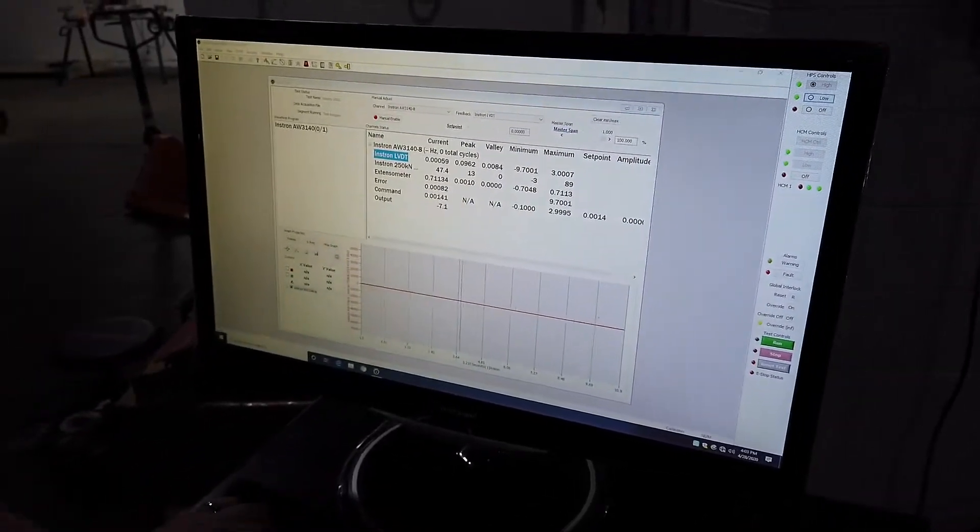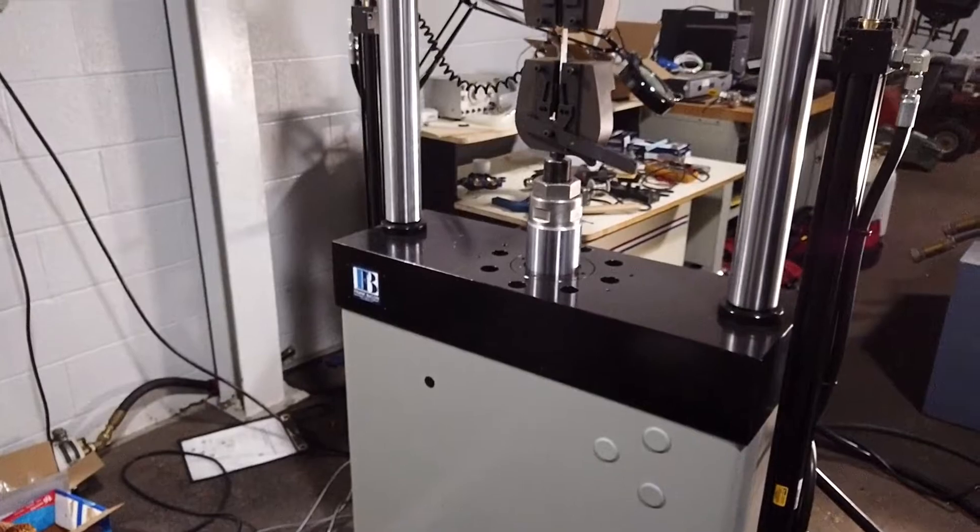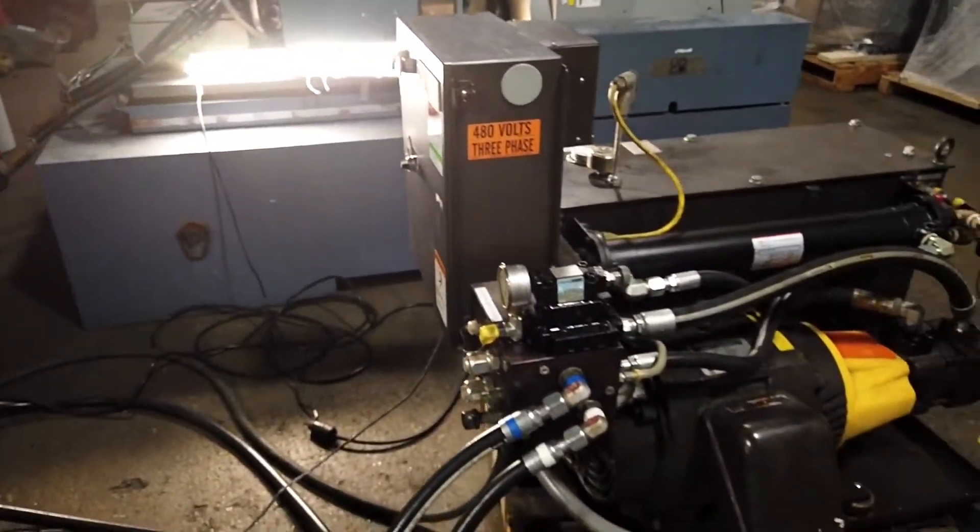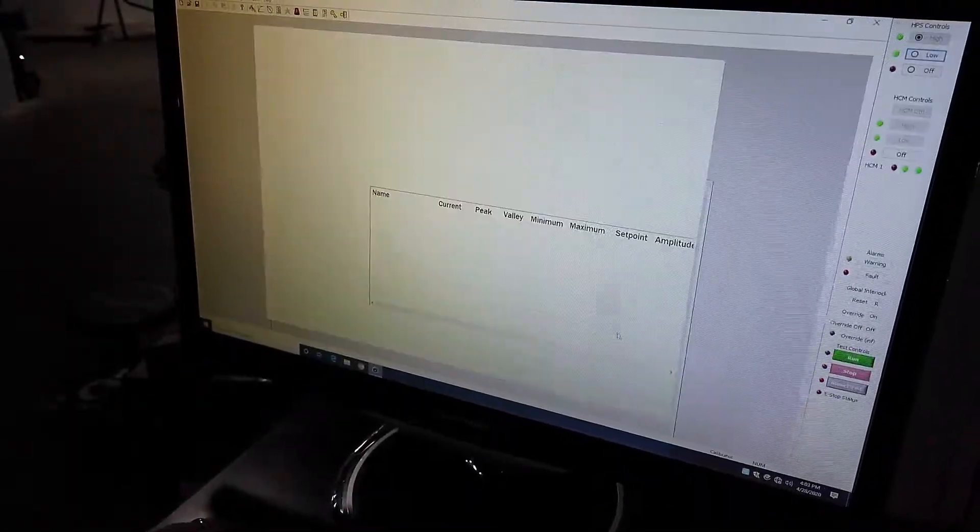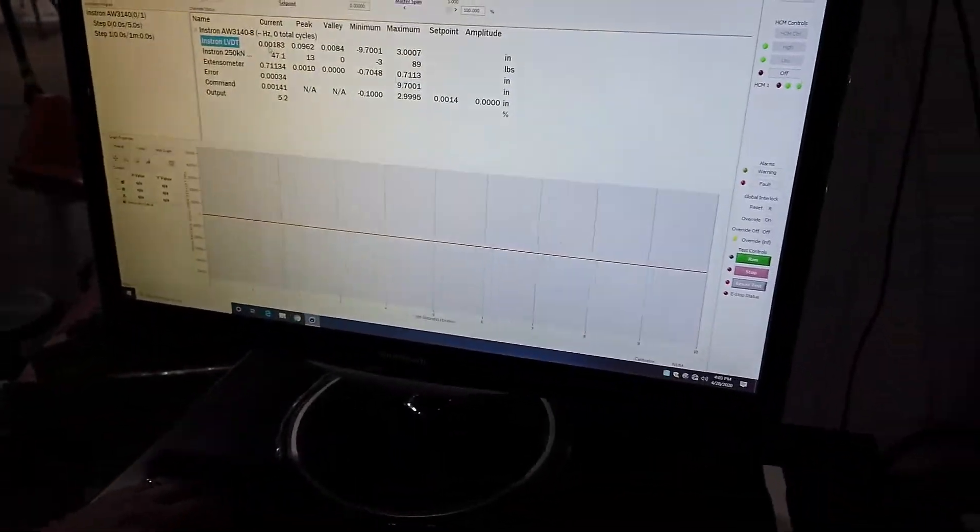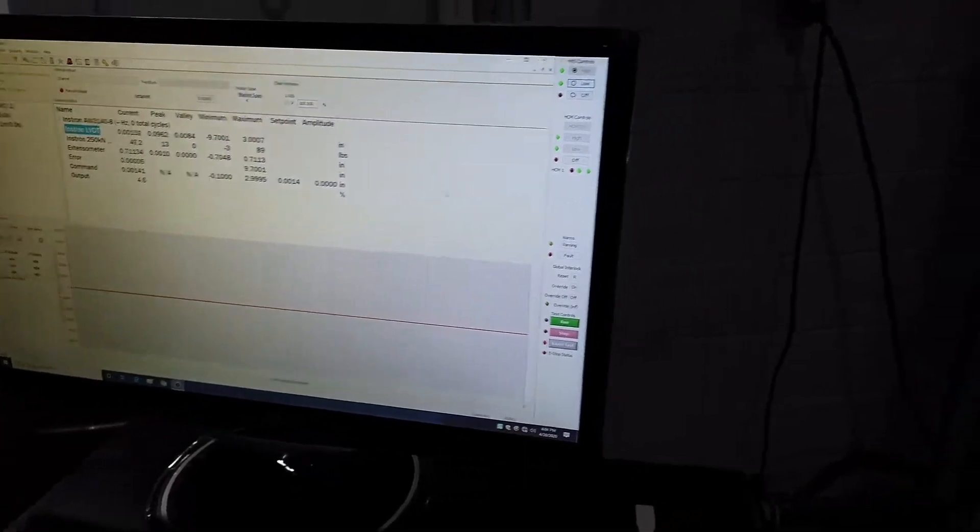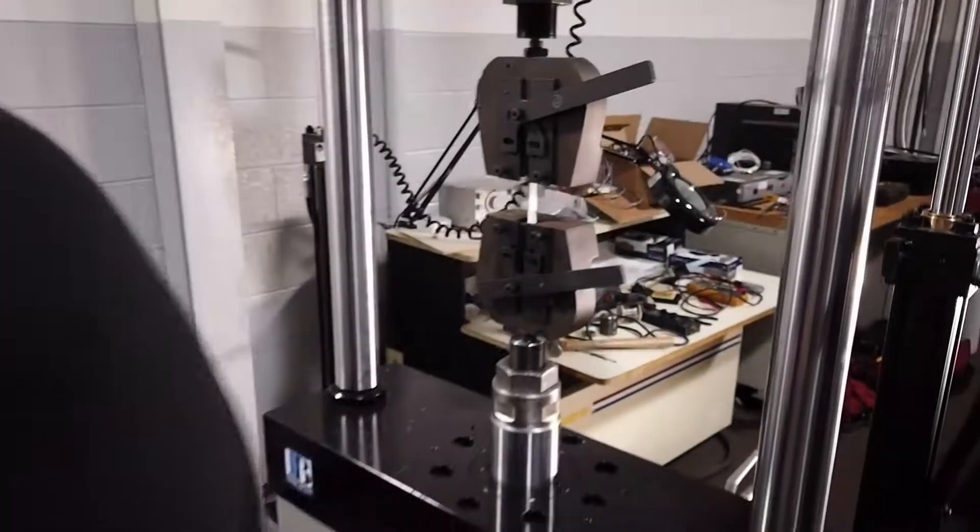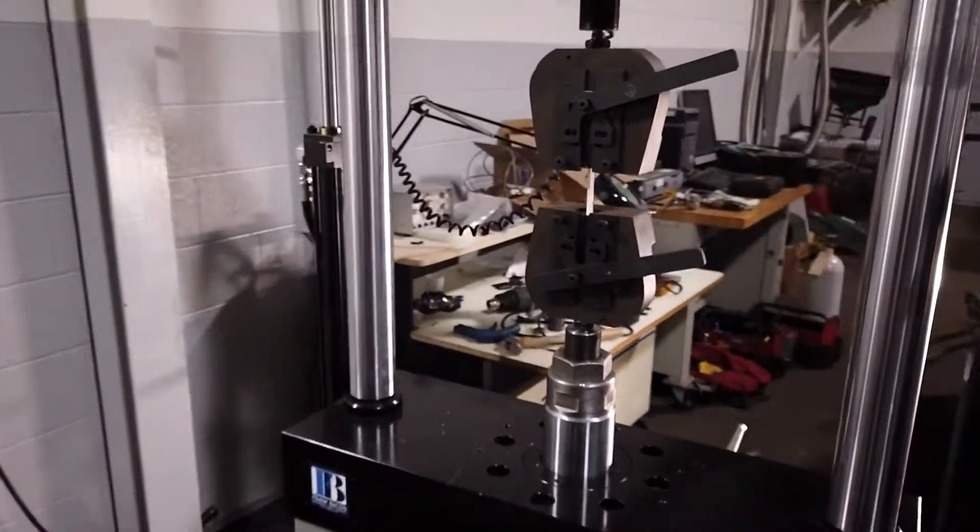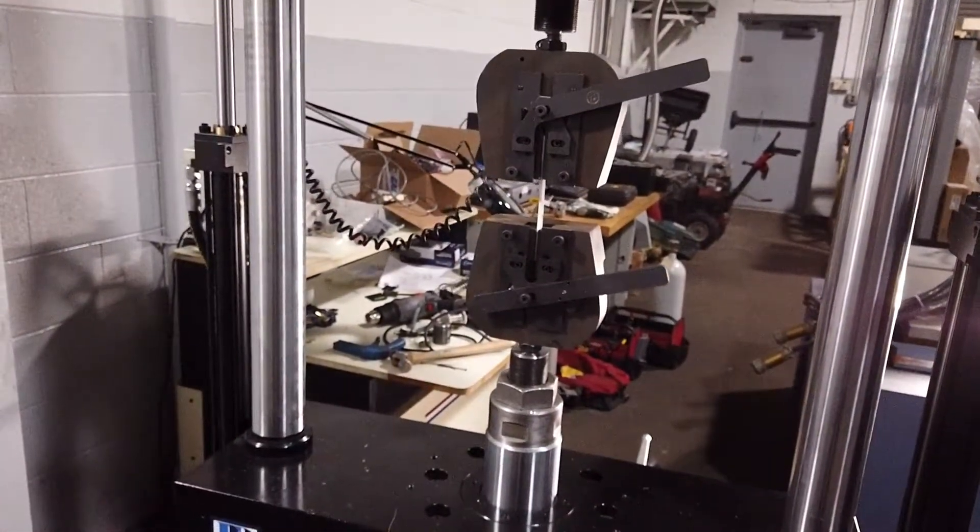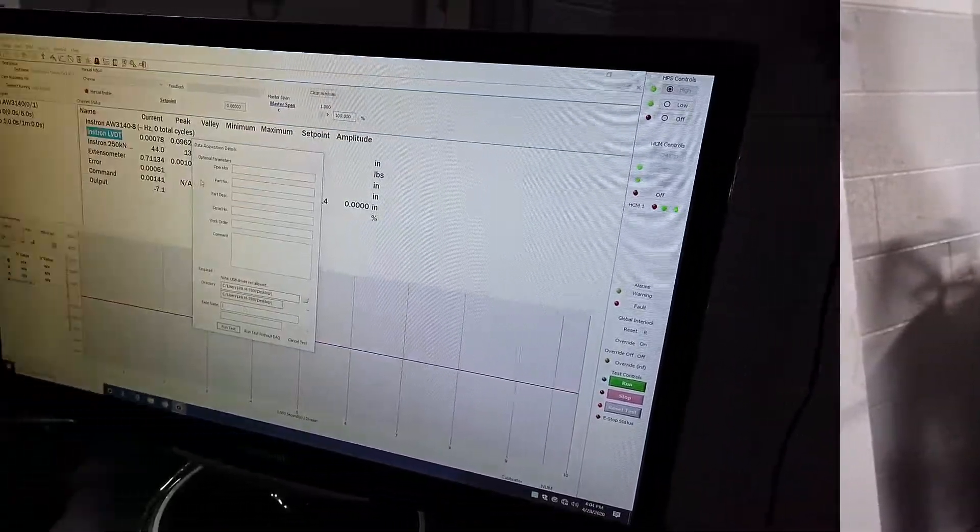Now we can start our test that we have already pre-designed. We're going to lower and set our grips. And then run.